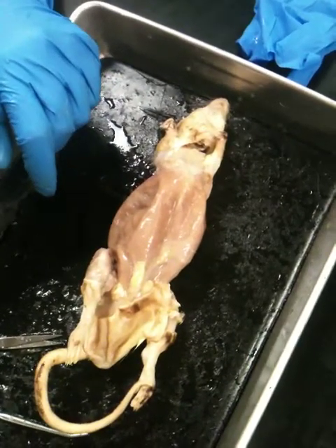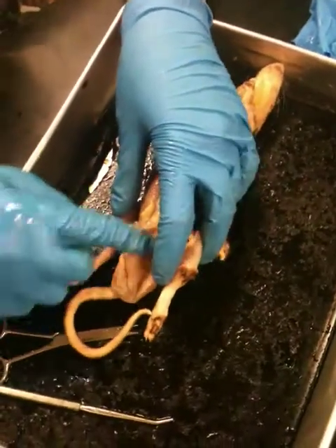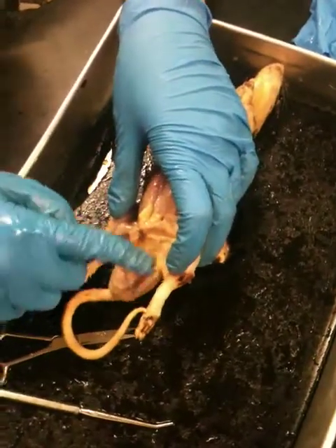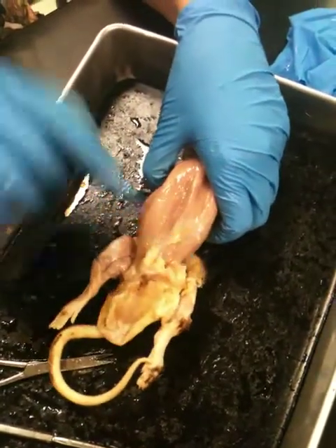Did you say there's a genital region, a pelvic region, and a pubic region? The genital portion where the genitals are, that is going to be the pubic region. Above the pubic region is the pelvic region.